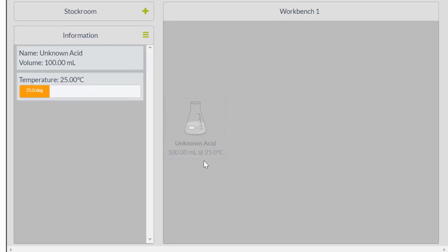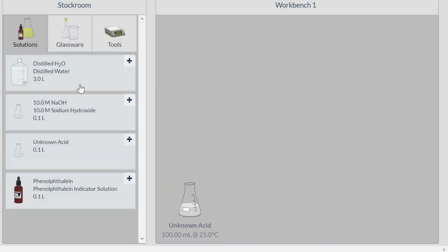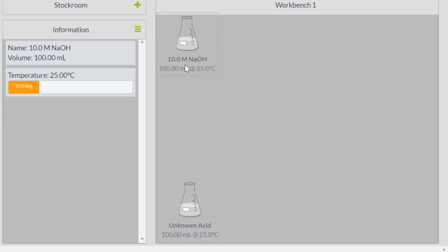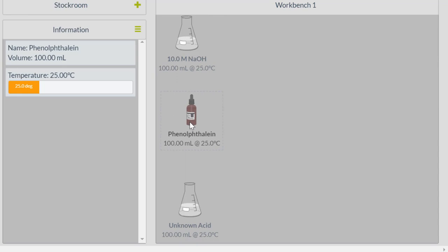So let's get to laboratory number one. We have an unknown acid. That unknown acid is going to be the M1, what you're trying to figure out. Your V1 is 100 milliliters. So you have one side of your equation right now, M1V1. Your M2 is going to be your 10.0 molar. You know that concentration. Your V2 is whatever we're going to do in laboratory right now. So your V2 is going to be how much we're going to use of this 10.0 molar in your acid to get to your end point.